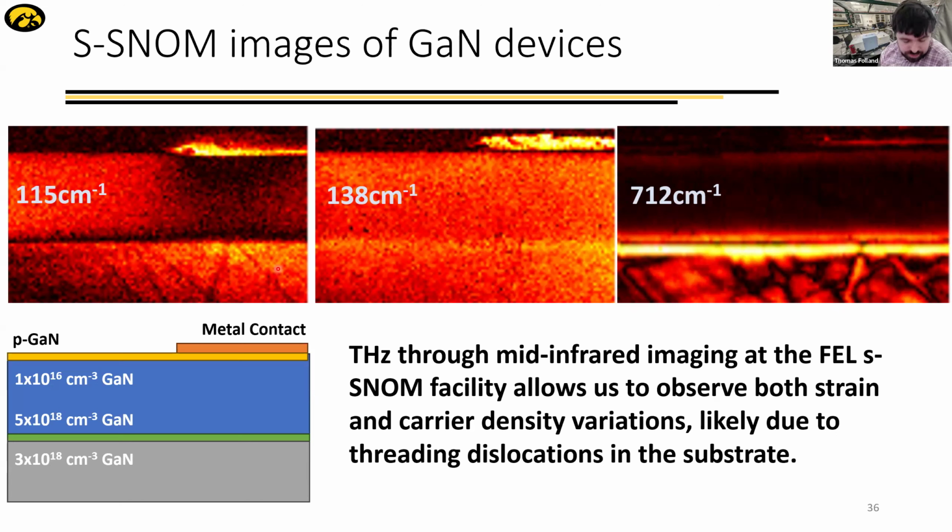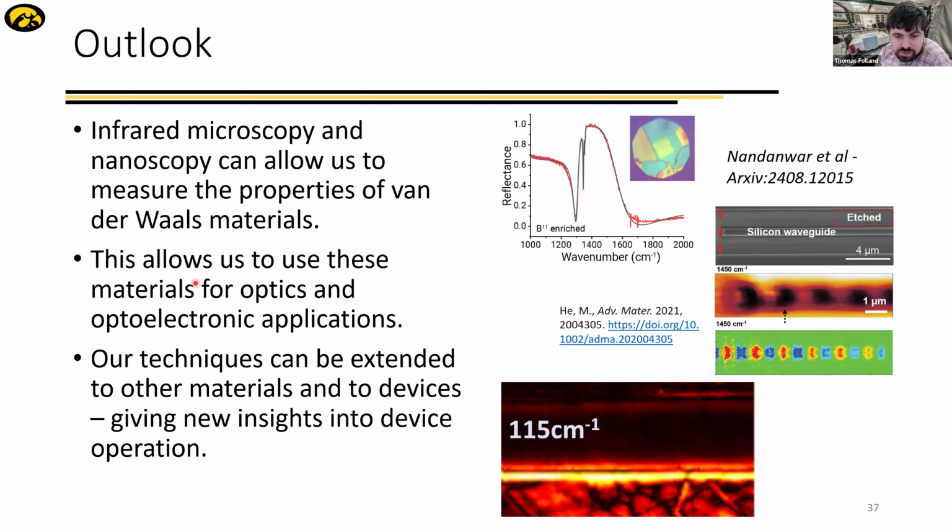that we are sensitive to using these near field techniques. So I think this is a nice result, and I include it mainly to show that these types of techniques can tell you far more than just about materials. They can also tell you about devices and imperfections in them. In this case, it was known the substrates were full of defects, and we've found defects. But we're really able to provide nanoscale spatial resolution on them, which we think is pretty exciting for the prospects for using these techniques in other areas.